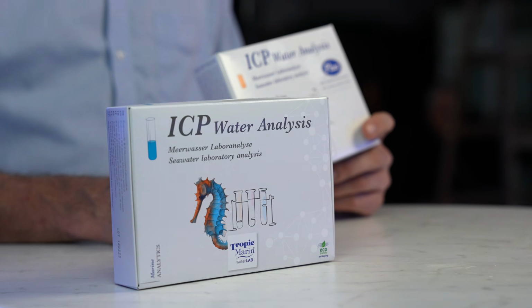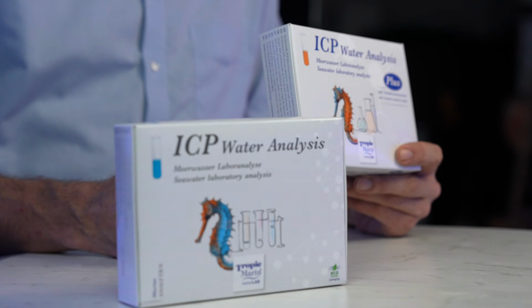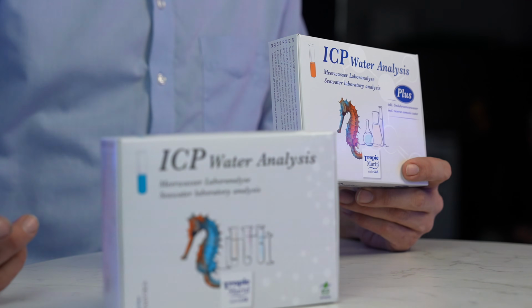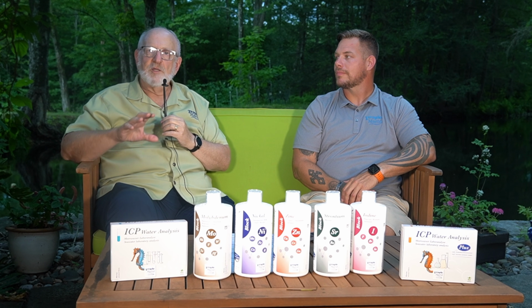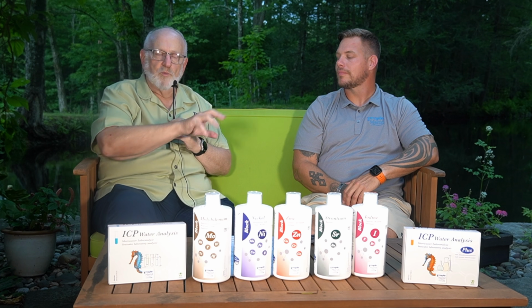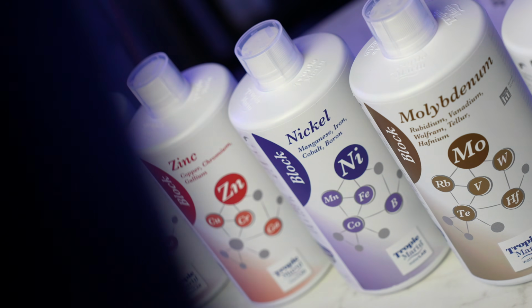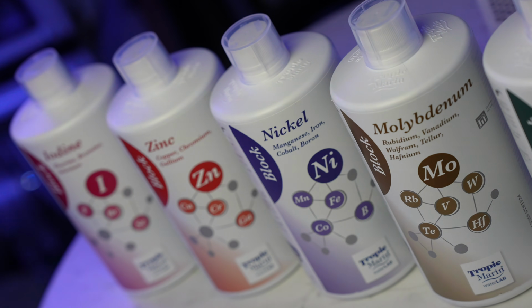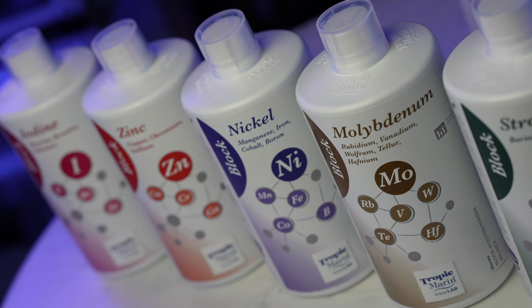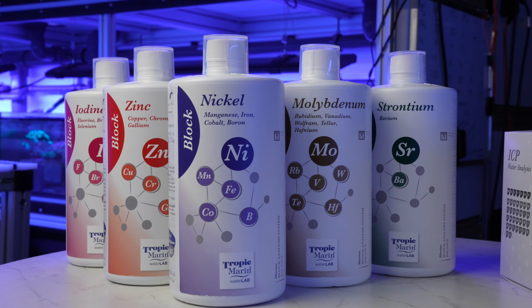When we got into the ICP project, there were some things that became apparent very early on that were super interesting. And the most interesting of all of it was that all those elements that we test in ICP testing exist in groups. We call them families. And those families are each involved in some different process. One might be involved in coral calcification and skeletal growth. Another one might be crucial to the coloration of the corals. Another one might be really important when it comes to protein formation and the soft tissue development in the corals.